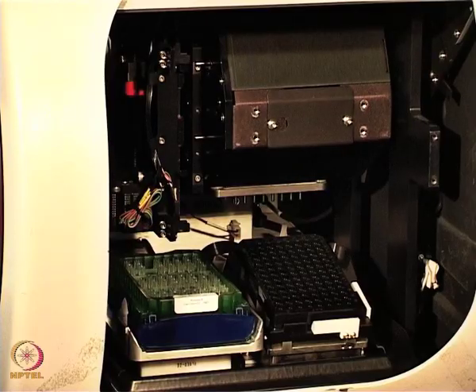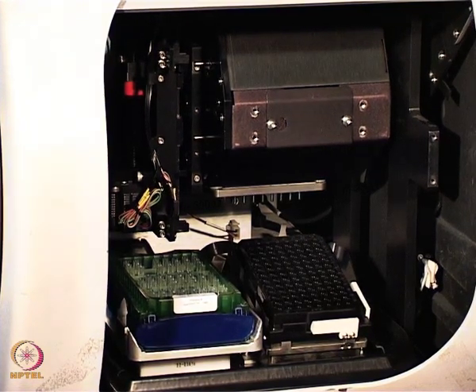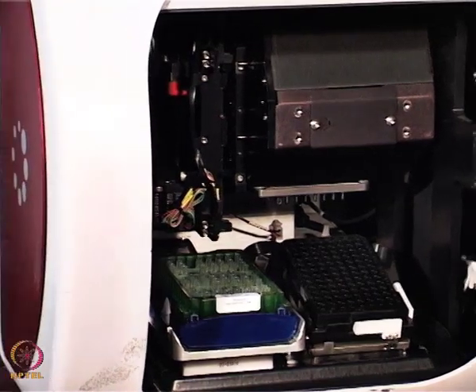Once the dissociation step is performed, the sensors are once again racked back to the sensor tray and the instrument's robotic arm moves to its original position. So now the acquisition is done. Now we have to go for the data analysis.